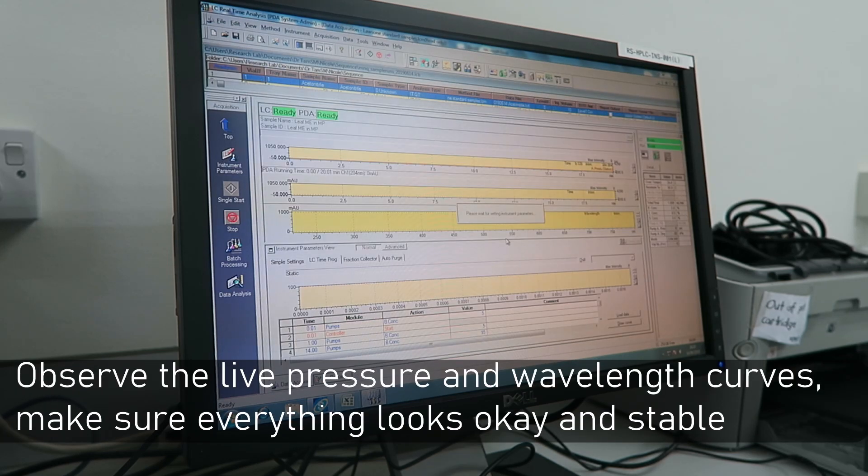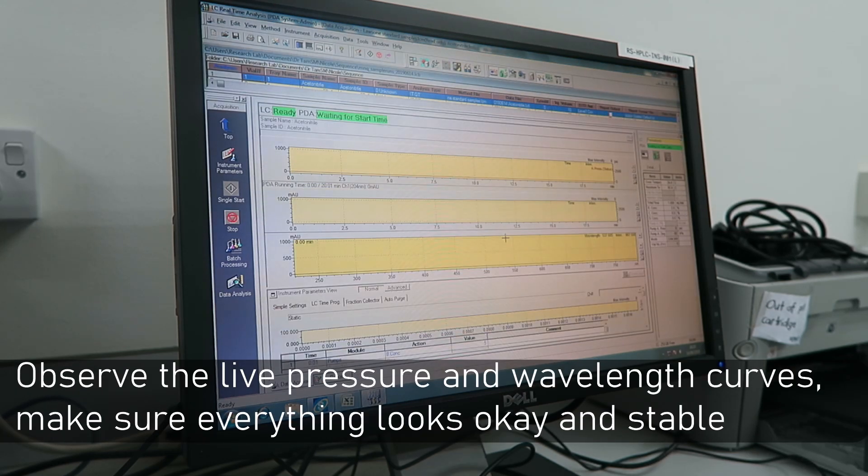Click Run and Go. Observe the pressure and the wavelength curves, and make sure everything is stable and okay before you set up the autosampler and let it run overnight.